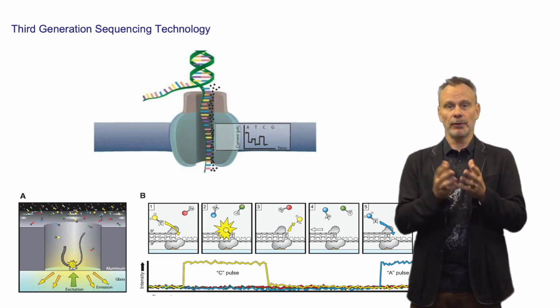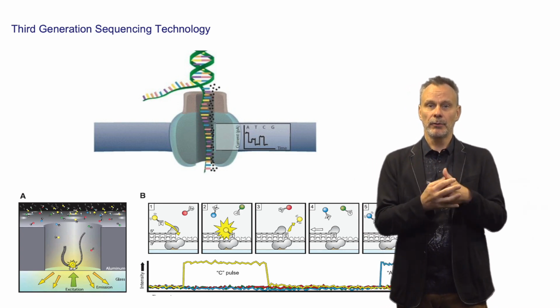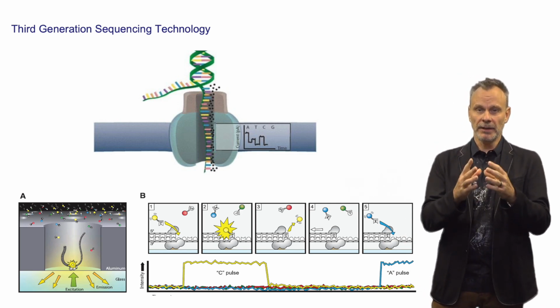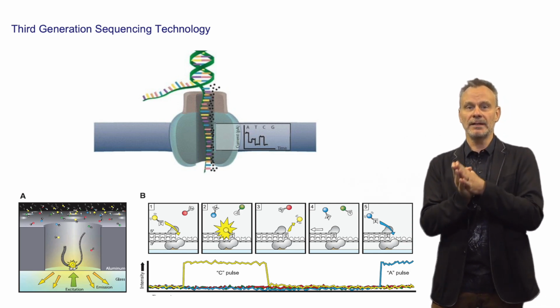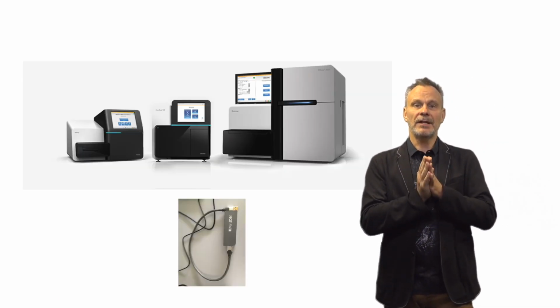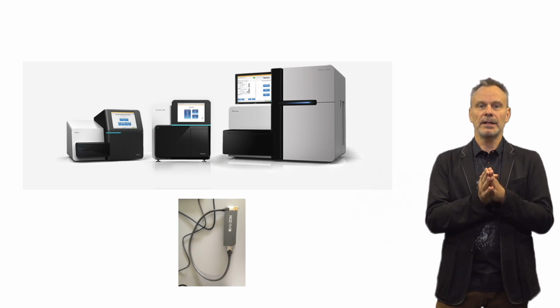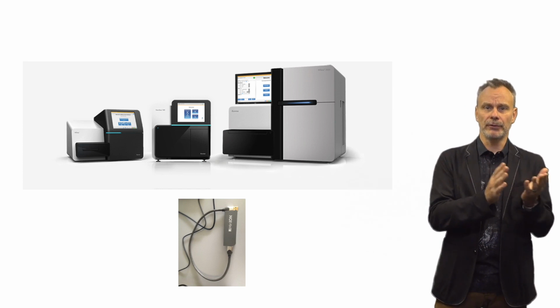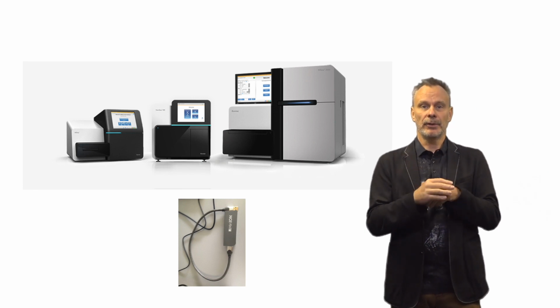Oxford Nanopore Technologies, or ONT, sequencing uses a DNA or RNA strand that is threaded through a protein nanopore embedded in an electrically resistant membrane. As nucleotides pass through the nanopore, they cause characteristic disruptions in the current, which can be translated into a DNA or RNA sequence. ONT can sequence extremely long reads, sometimes over 2 million base pairs, offers real-time sequencing, and is highly portable, like their MinION device. Error rates are higher compared to second-generation methods, but like PacBio, they are typically random and can be corrected with higher coverage.